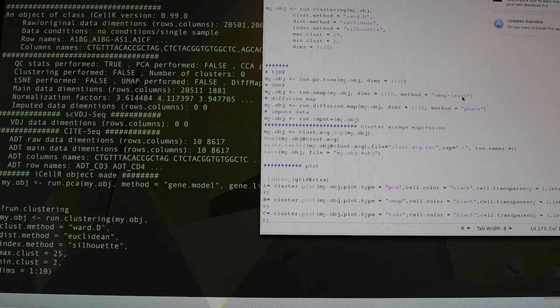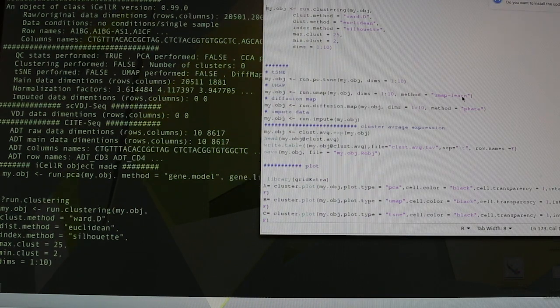I have a question following on your talk about the normalization of antibodies. What's the rationale of normalizing by rows, by the antibodies? If you have the columns as cells and you have only 5 antibodies, and you count them all and summarize them, sometimes they're not captured so well for each cell.